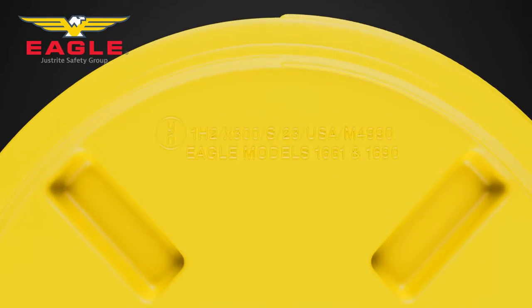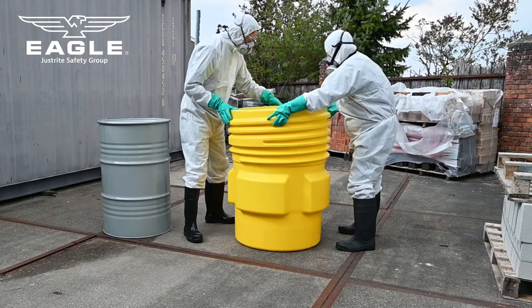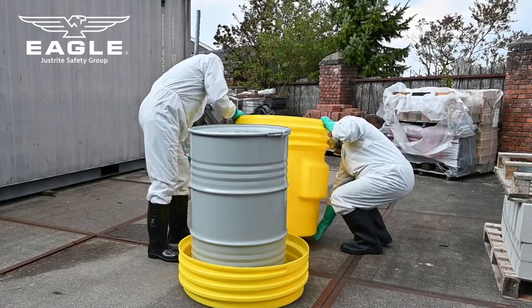With a United Nations certification, the long lasting construction of our poly drums ensures that hazardous materials can be transported, stored, or disposed of safely. Used in both industrial and commercial environments, the primary use of overpacks and lab pack poly drums is to transport and store hazardous materials.